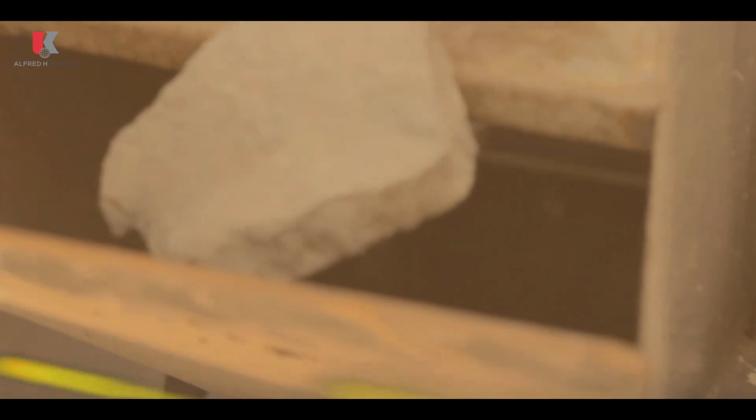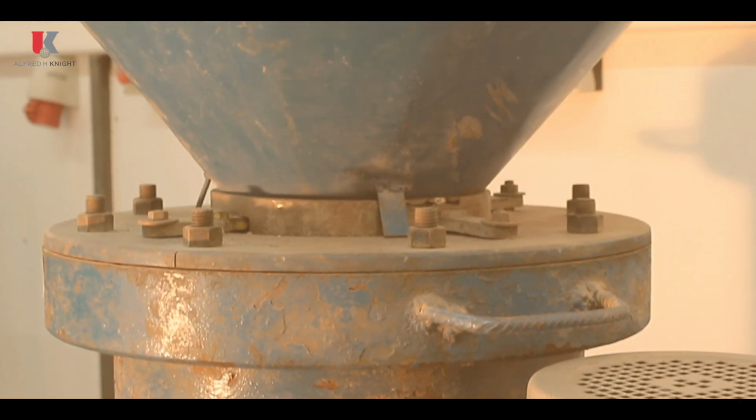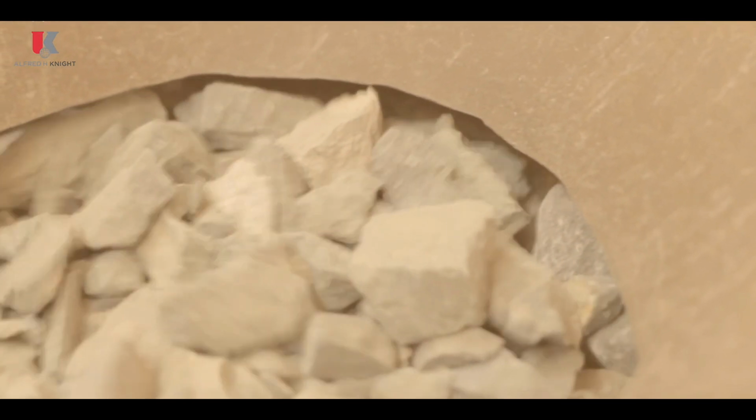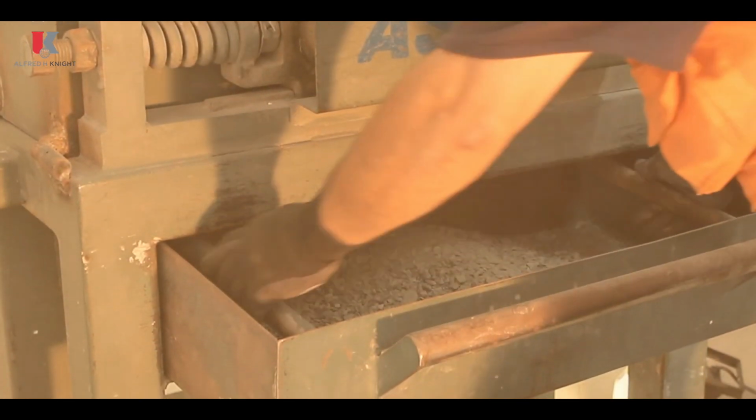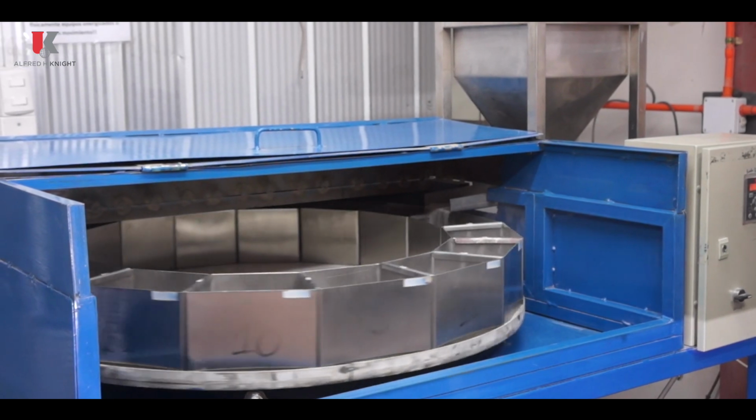and thickening. Crushing aims to reduce the size of the ore particles in a controlled manner to obtain a sample with the required size distribution for each test. The crushed sample is divided to obtain representative samples.